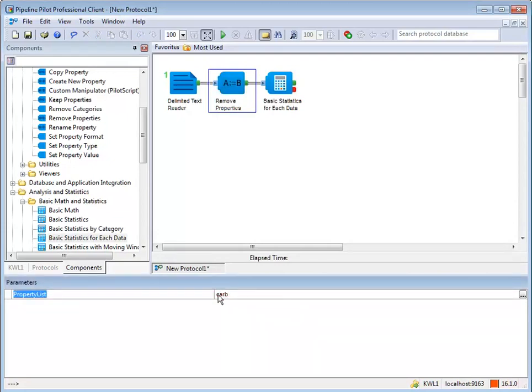Double-clicking a component in the hierarchy window will automatically position and connect it to the end of the last open-ended pipeline.